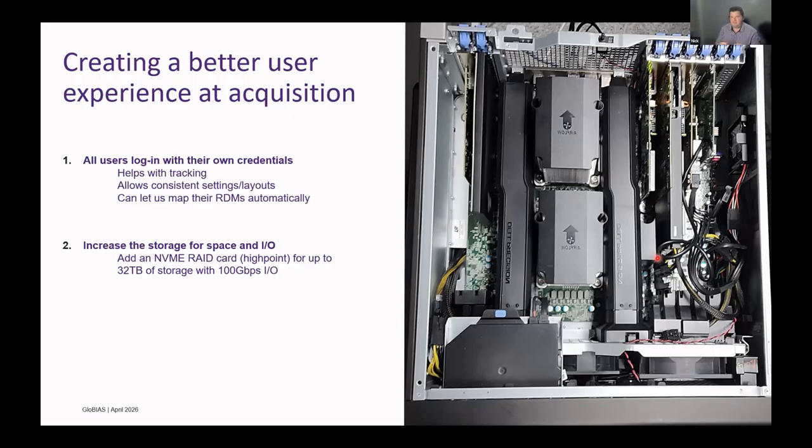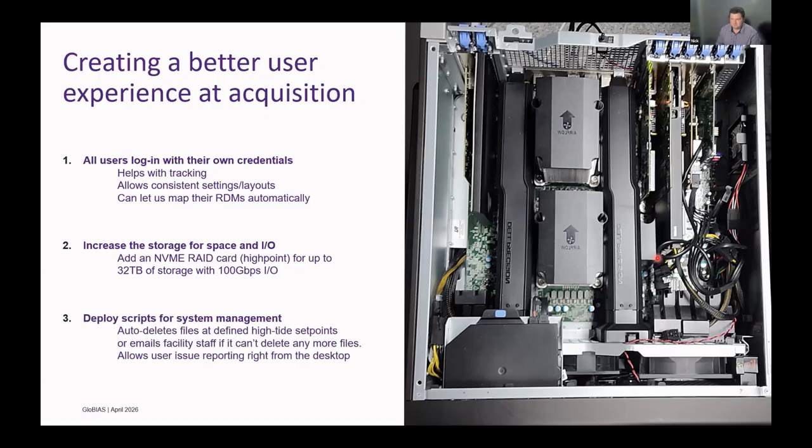So that just means that users don't have to wait to the end of their session, and the data that's moving off is not speed limited by the hardware, because a typical microscope might come with some SSD, or maybe it's got a small NVMe stick, but for our use case, usually that's not enough.